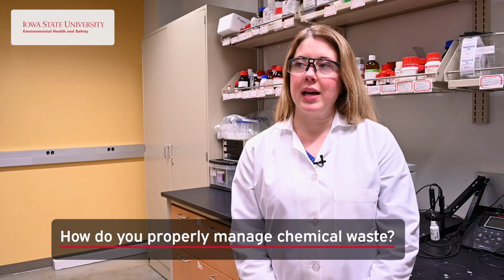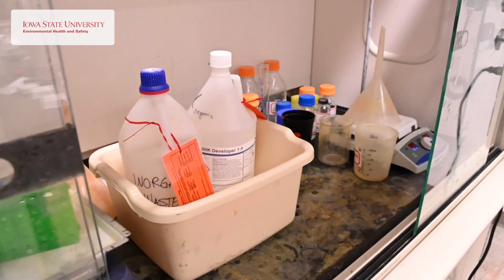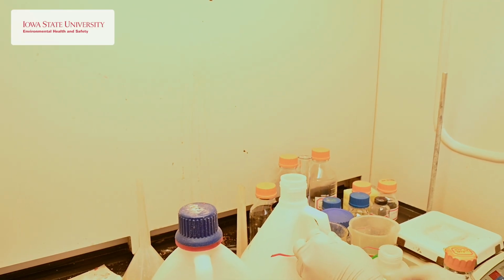So our lab has to do several different steps to make sure that we're properly managing hazardous waste. First of all, we keep a record of all of the waste and separate it by class. And then we make sure that all of those waste containers are large enough in volume to handle the amount of waste that we have, and that they're capped and kept in secondary containment.